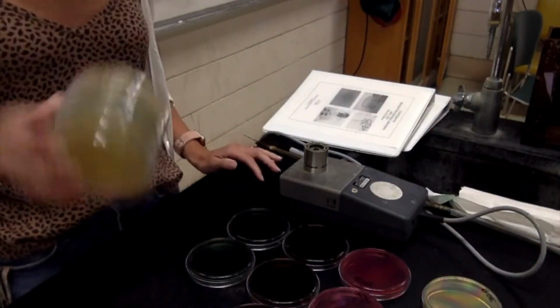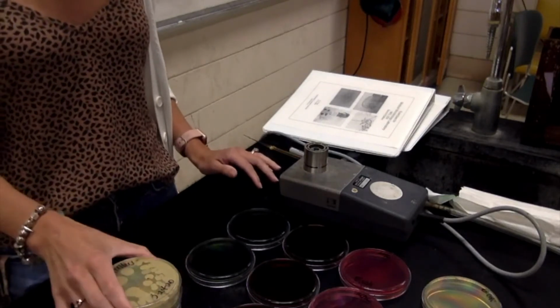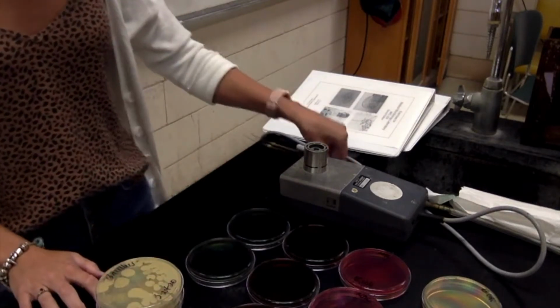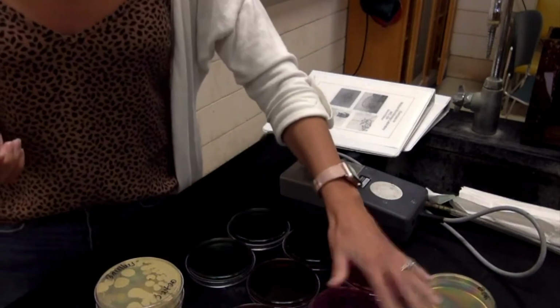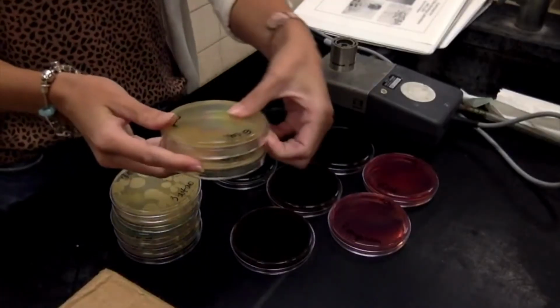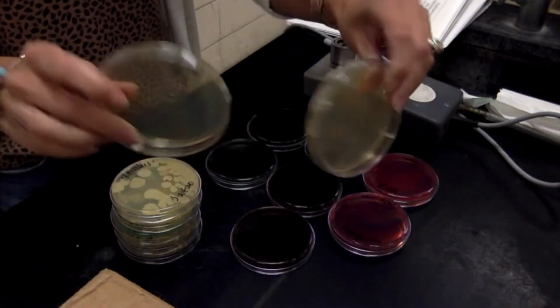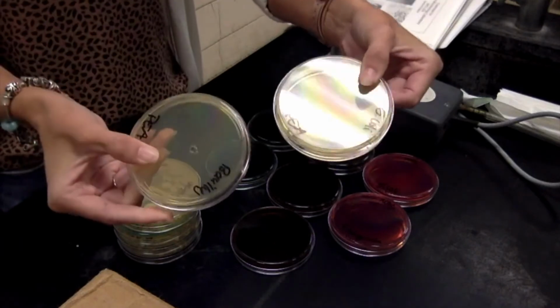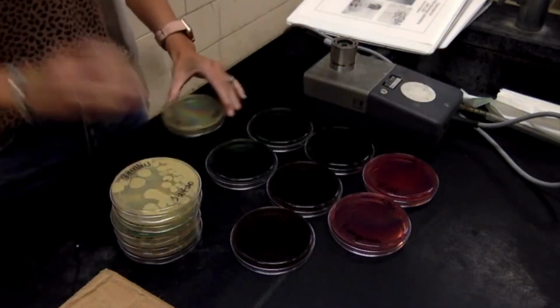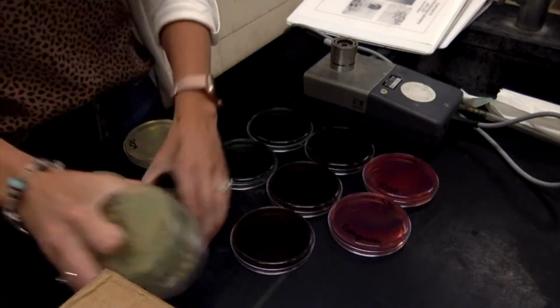And I've got all of my bacteria, and actually I'm going to be using them from my original plates today, just because it usually gives better results because there's more bacteria that's placed on the plate using solid media. So I'm going to start out with the PEA. Here's what the PEA looks like starting out. Okay, so it's a clear plate, really no color to it. It's kind of like a yellowy looking color a little bit, but that's what it starts out as. So my two bacteria that I'm using for this are going to be Bacillus and E. coli.